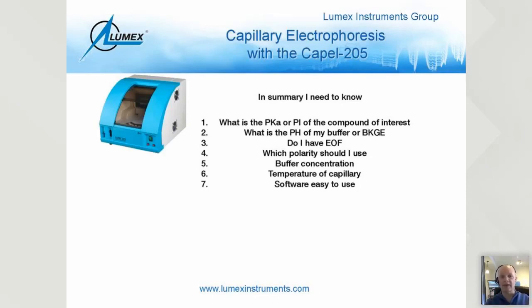So here, if we have too high a concentration of buffer, we're going to have what we call a current leak. The system's going to crash and there will be no separation. So you'll see there are some papers out there that have tested the buffer concentration, and people have found the buffer concentration that is best for better separation and making sure nothing crashes.